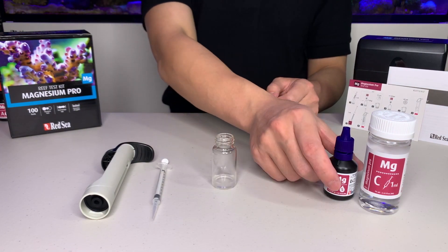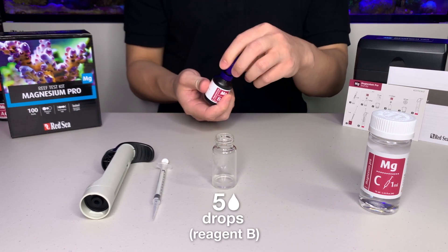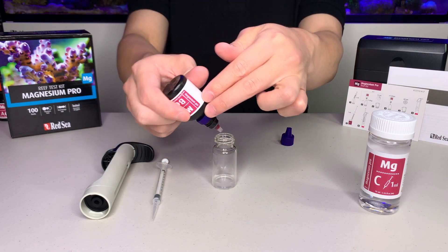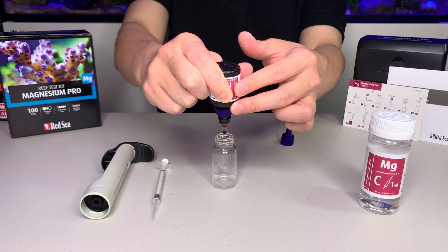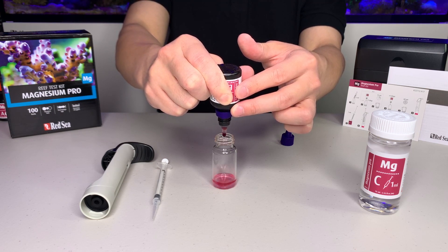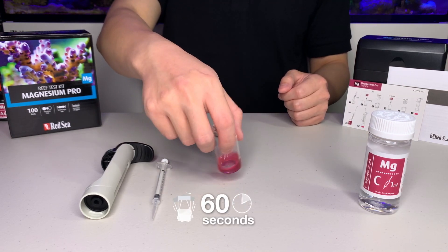Next, we add 5 drops of reagent B into the vial. Again, make sure the bottle is completely upside down. Then we shake the vial gently for 60 seconds.